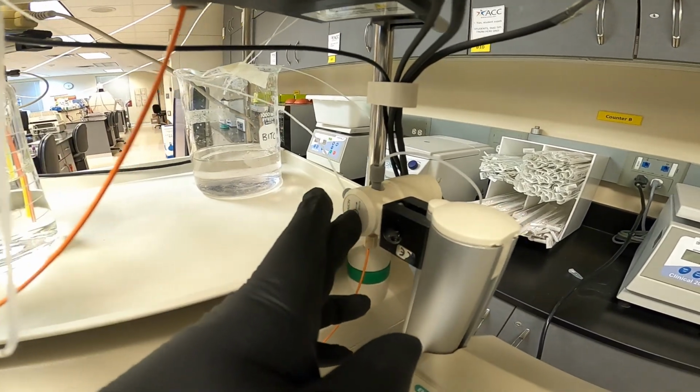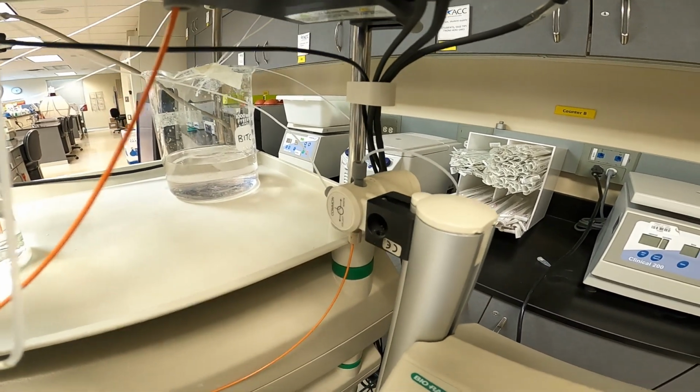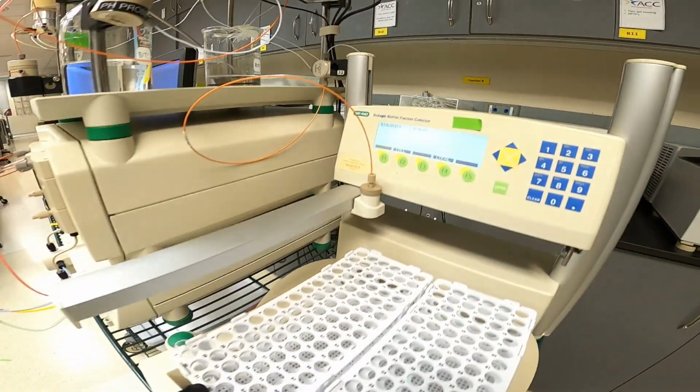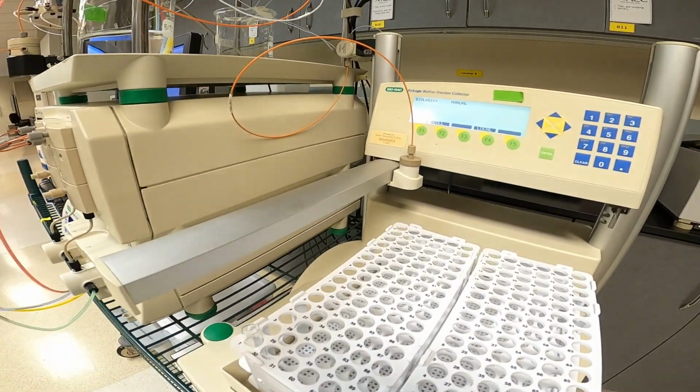This is also a small diverter valve. So right now we're just going directly to waste, but once we start doing our runs, we'll set up the software to divert to the fraction collector here. Here's where all our tubes will sit and collect the fractions throughout our purification.